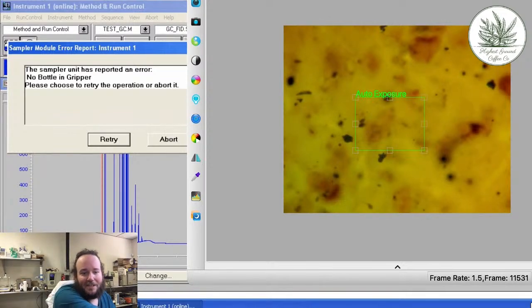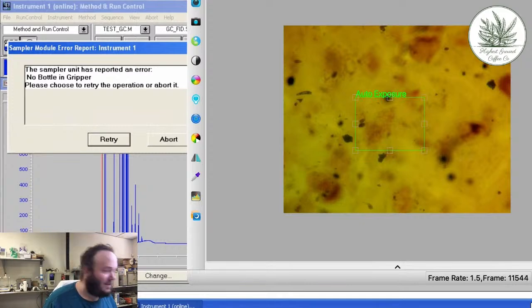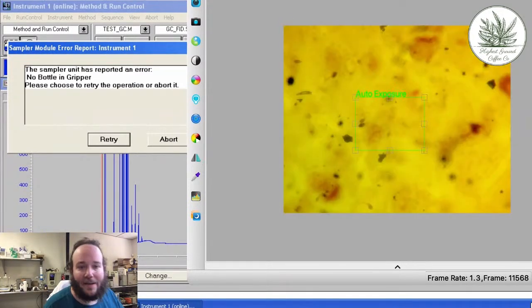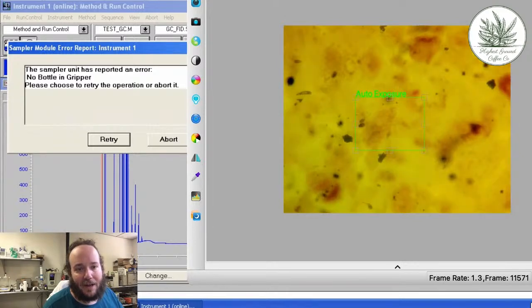So one of the fun things about microscopes like this one, the focus is so damn sensitive. Sometimes you might end up with your focus on the bottom layer or at the very top or some dust or whatever. It'd be really hard to tell. Then down here is this little aperture thing. It just lets you control the amount of light, which you can kind of use for contrast purposes. It's not a whole lot to contrast with here.